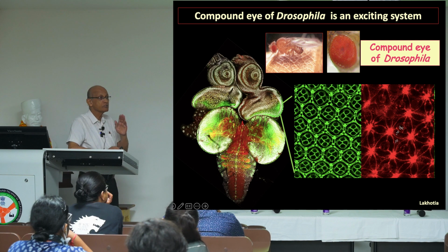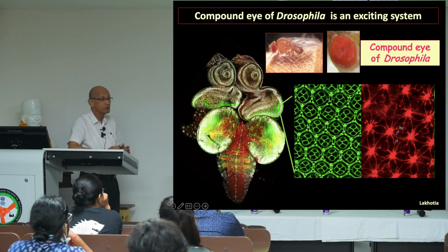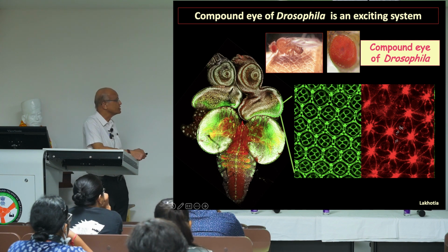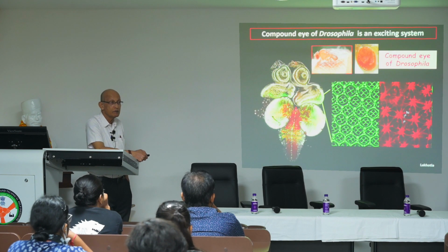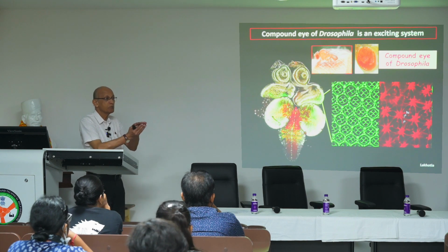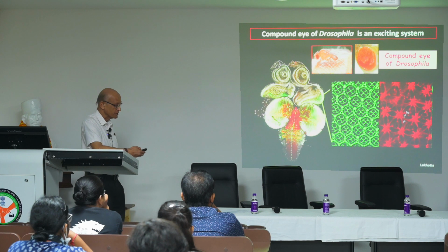That's something we cannot see with a normal imaging system, normal bright field microscopy, or even fluorescence microscopy. If I were to look at this with a typical fluorescence microscope, I can stain both red and green, but I won't be able to distinguish individual structures, because out-of-focus images will blur the real image. That's the advantage that confocal microscopy brings.